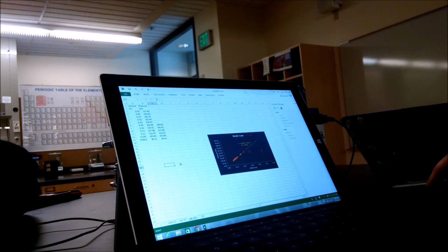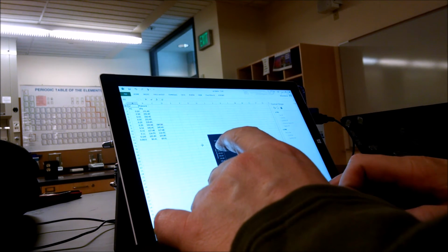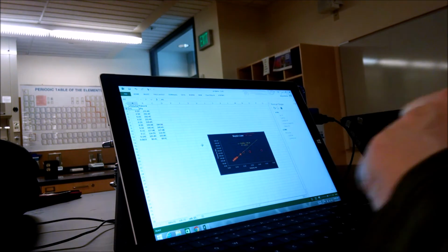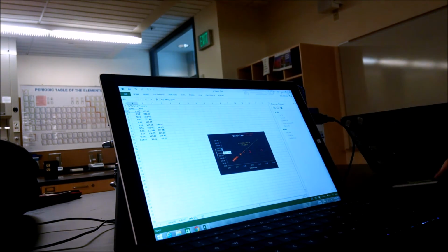What else? Change the title in column A. Oh, of course. So you can just do 1 over volume. Yeah, because inverse volume, that's going to take up forever, right? I have to make the column too wide. And this I'm going to put 1 over milliliters there. Okay. Sounds good. In Calc 2, update the x-axis title in the chart.